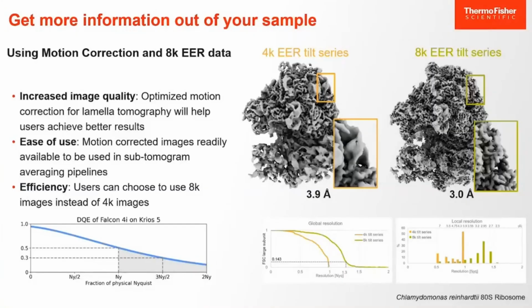Important maybe to mention that although the file size of the 8K sample is 4 times larger than the 4K sample, there are no time penalties when you use 8K versus 4K. They're equally fast in both cases.